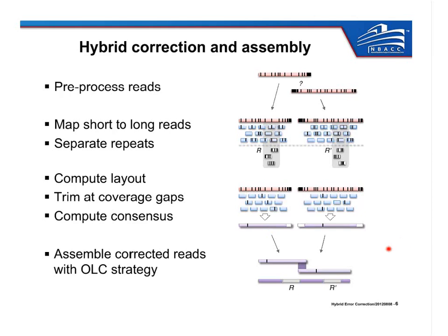These corrected reads then can be used for anything a normal read can be used for, and this is a key difference of our approach. Because we're able to do correction, we're not relying entirely on the Celera assembler. You could take the corrected reads and use them with any tool that you like.